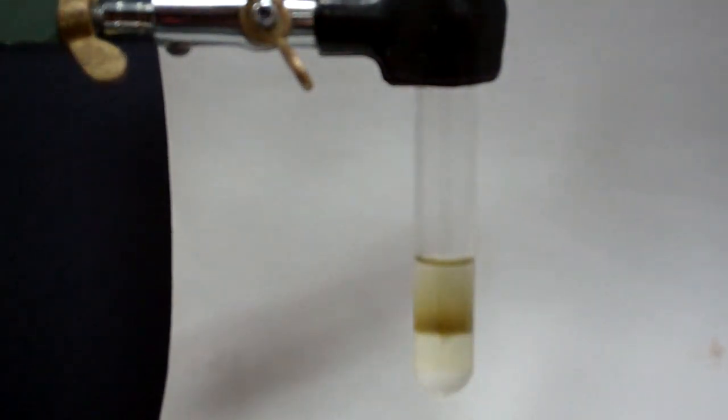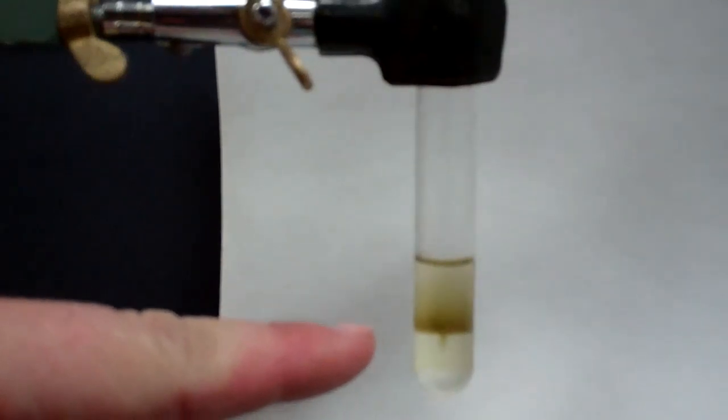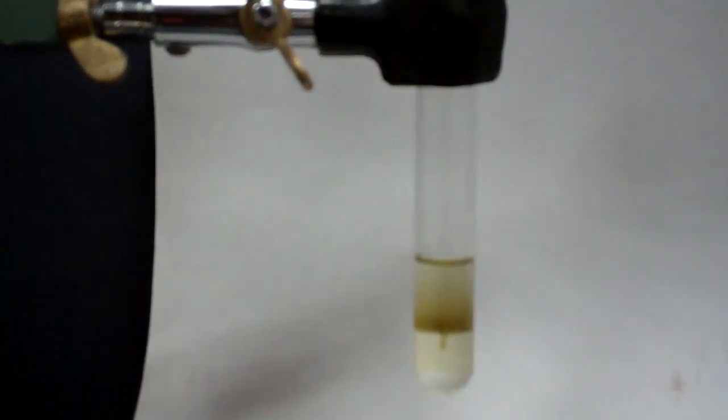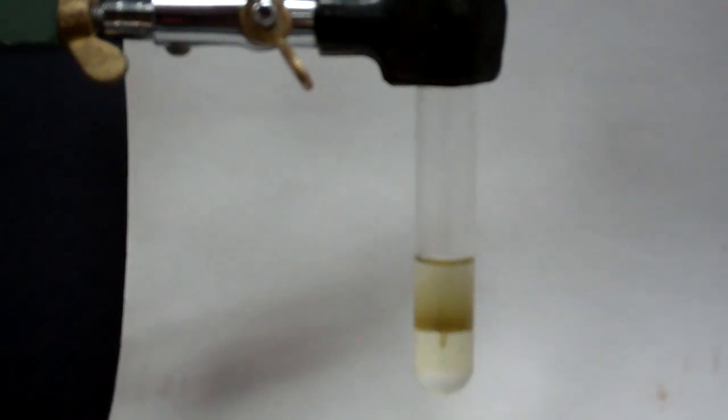If I put up my white background, here you can see that brown ring that is forming where those two solutions are meeting. And that is the sign of a positive test result for the nitrate ion.